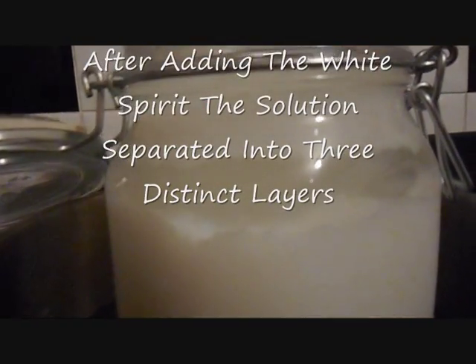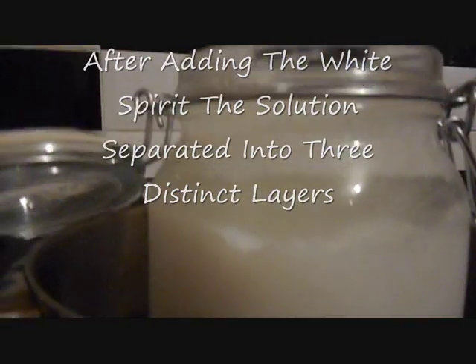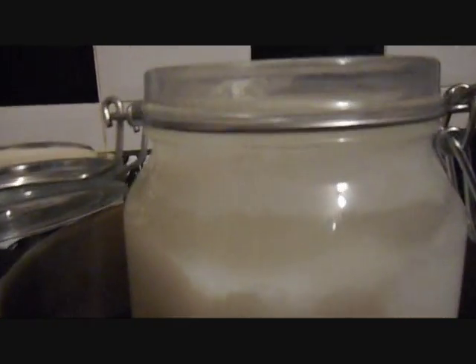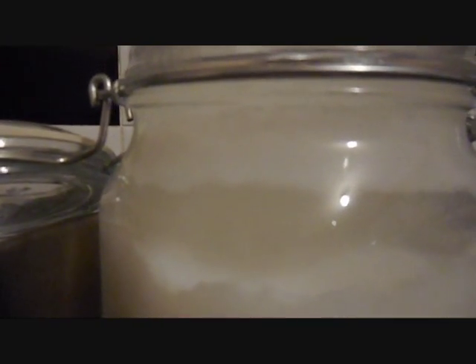I've got a bit of an anomaly because I've got 3 layers. I've got one layer that's at the bottom. You can see the fluid in the middle here, and then there's another layer on top. I don't know what it is. So I'm going to try and extract the middle layer. I'll try and save the top layer as well if I can.